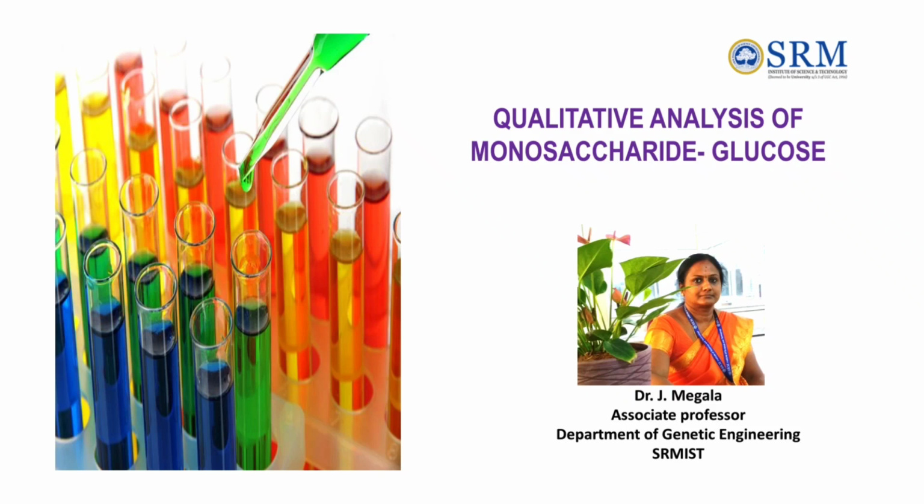Would like to present a video on qualitative analysis of monosaccharide, glucose from known sample, blank sample, and glucose from food source date sample. The video will be helpful as it covers the basic information on monosaccharide, principle involved in the analysis, reagent preparation, and test involved in screening for the presence or absence of glucose in known sample, food source, and blank sample.